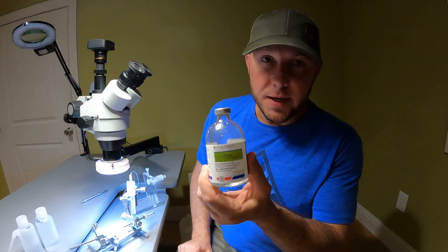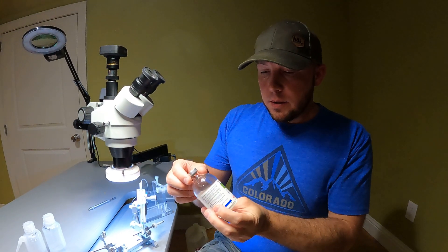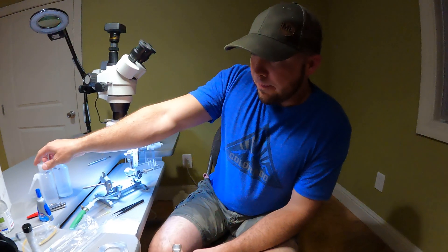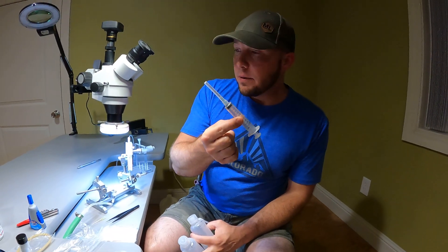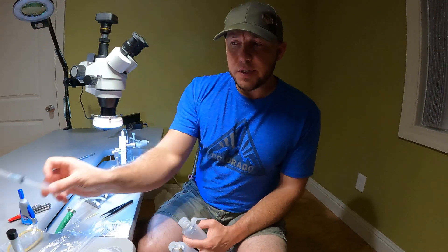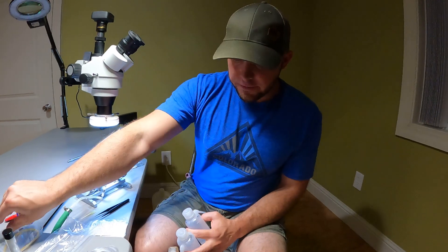You'll need some antibiotic — gentamicin is what I use. It's prescription only, but if you tell your vet you're doing some bee breeding work, they should be able to write a script for you. These are really good syringes for putting a little bit of saline solution out to flush your tip, or just keeping saline solution with antibiotic handy. I usually keep a couple of these filled.